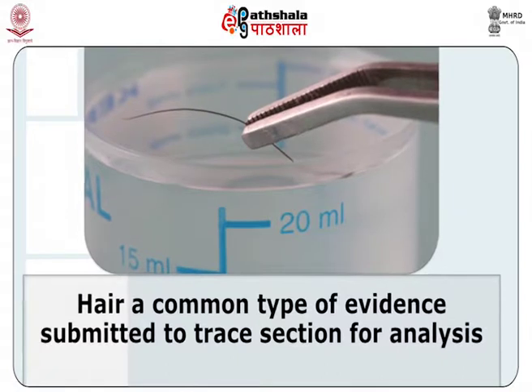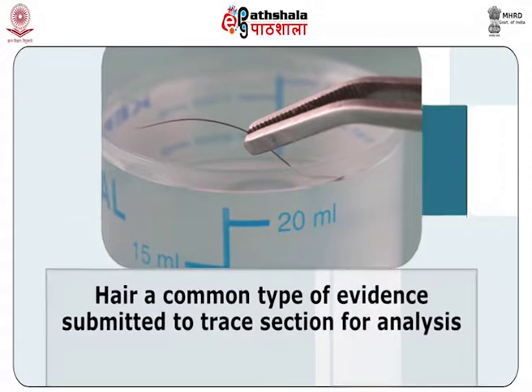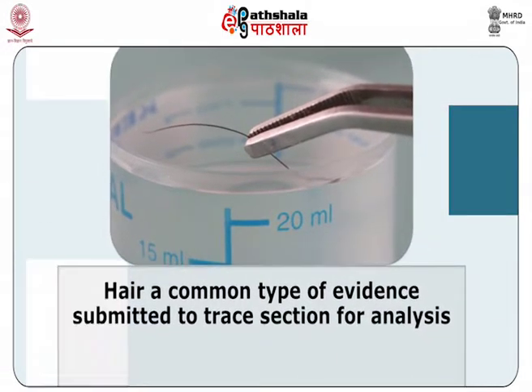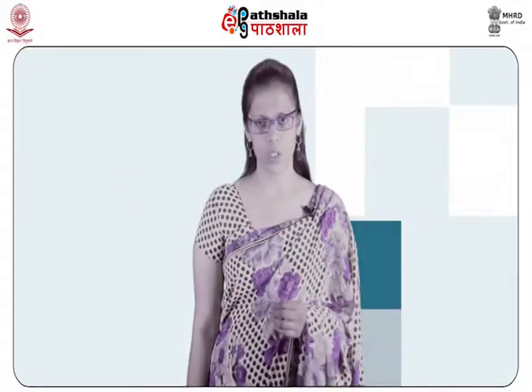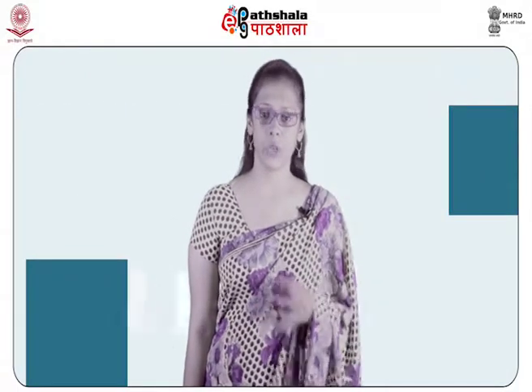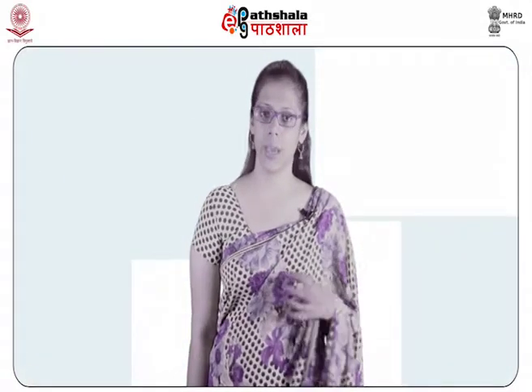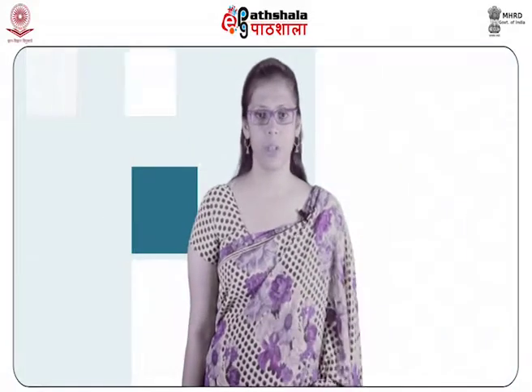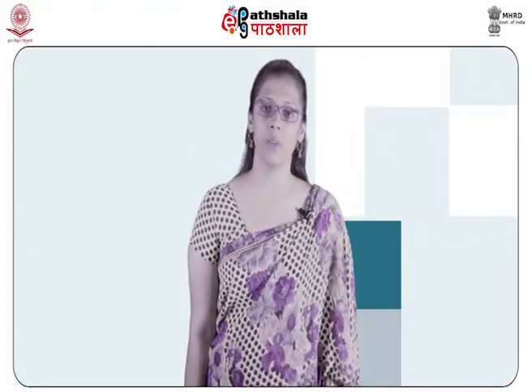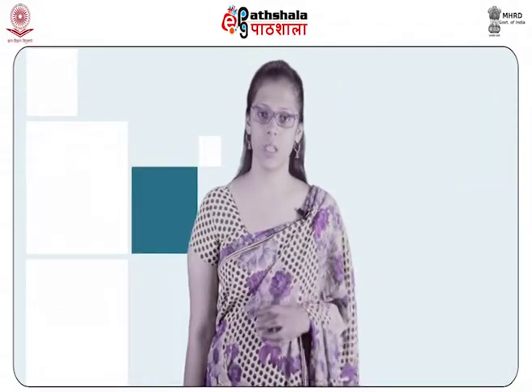Hair is a common type of evidence submitted to the trace section for analysis. On average, humans shed approximately 100 head hairs per day. Because we are continuously shedding hairs, forensic analysis of hairs is beneficial to the establishment of association between individuals, a person and an environment, etc. For example, a questioned hair from a victim's clothes is examined and found to be consistent with the suspect's hair.